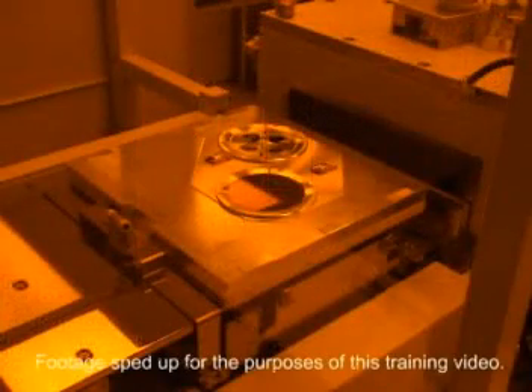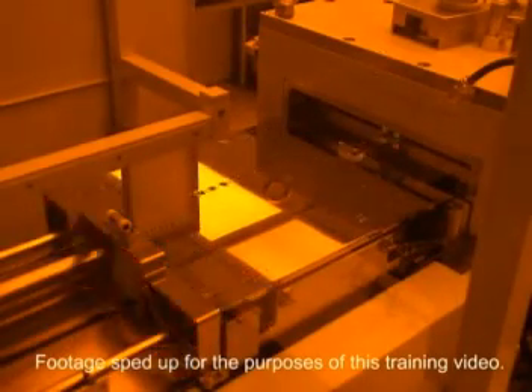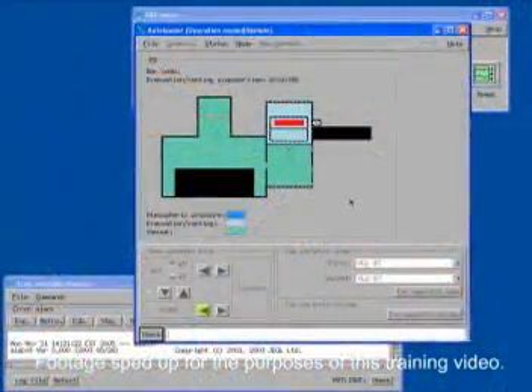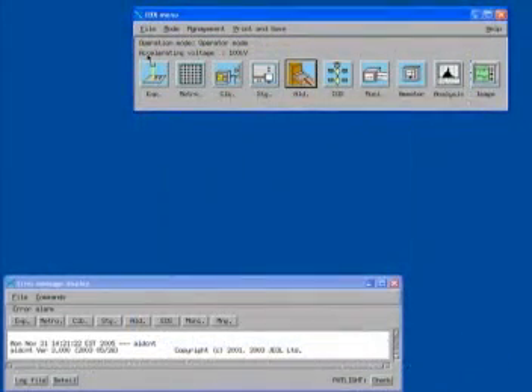The software will automatically load the cassette into the system. It will first load into the ALD, which is similar to a load lock. It takes approximately 15 minutes for the ALD to pump down into high vacuum. Once the ALD reaches high vacuum, the cassette will be placed onto the stage. The ALD should then return to the home position. When you are finished, close the ALD window by selecting exit from the file drop-down menu. You should now be able to run your process.